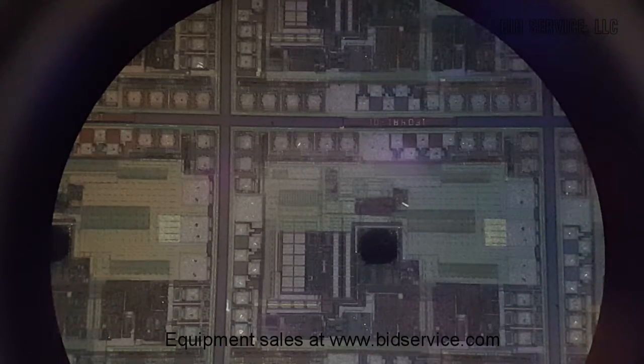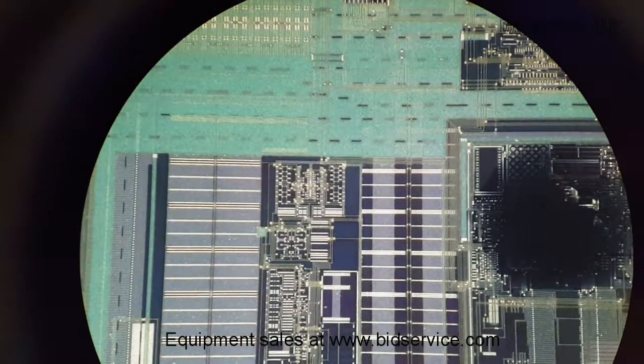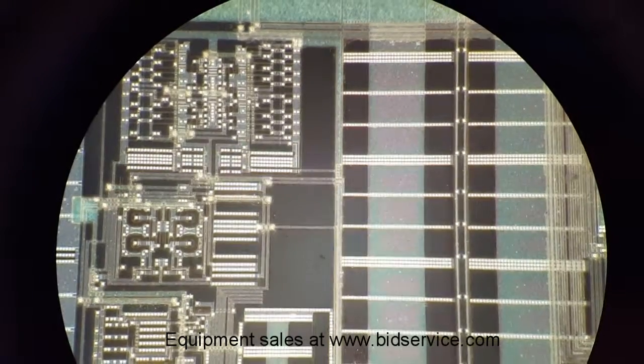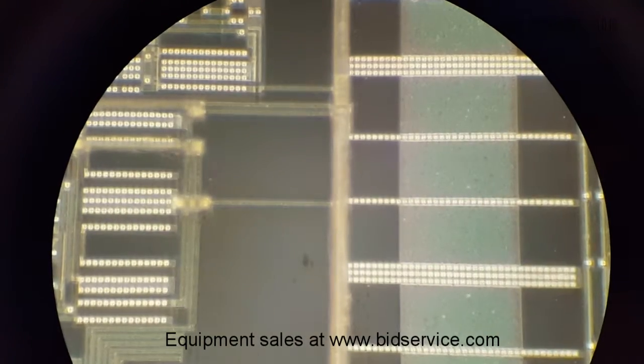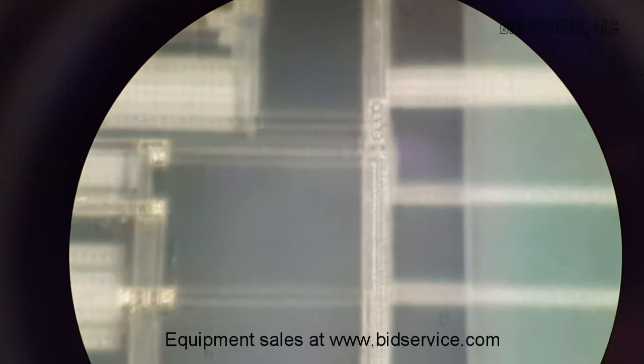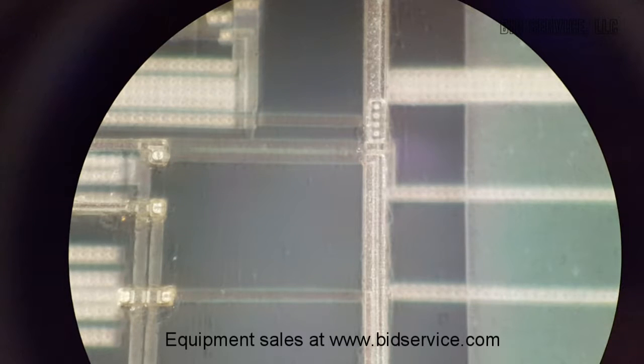Okay, this is the polarized block at 5x, then 100x with a tiny bit of fine focus. Here's the 150x with a little bit of fine focus as well. We can adjust the f-stop a little to give it a little more depth of field.